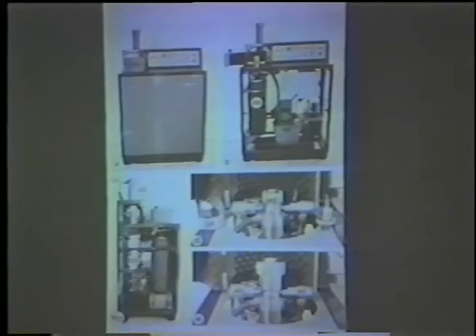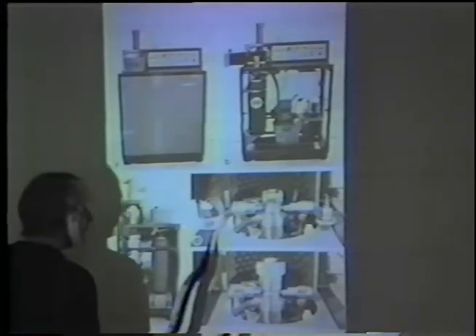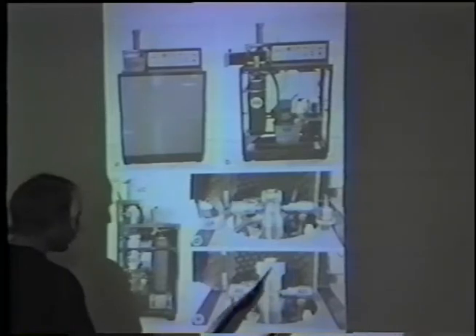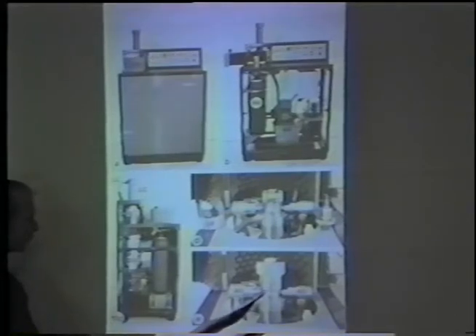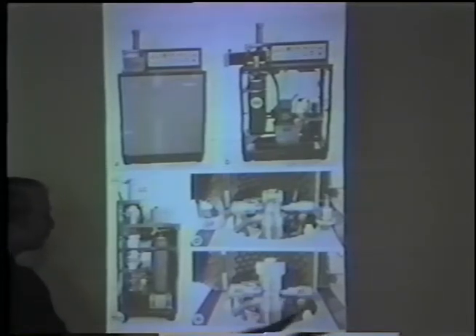It's designed very similarly to the chamber in an artillery piece or a rifle, for good reason. These are ballistic applications of pressure. Both the rise time and the absolute pressures reached are ballistic in nature. You could shoot down a plane with this machine. And here's a system with a locking ring in place. And here are the aperture retainers. This is where the liquid nitrogen comes roaring out, and acoustic dampers.